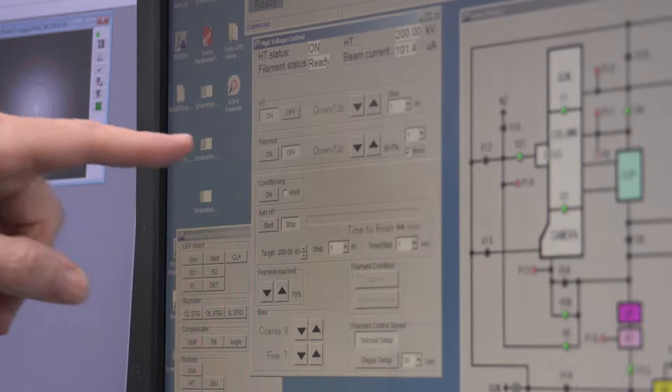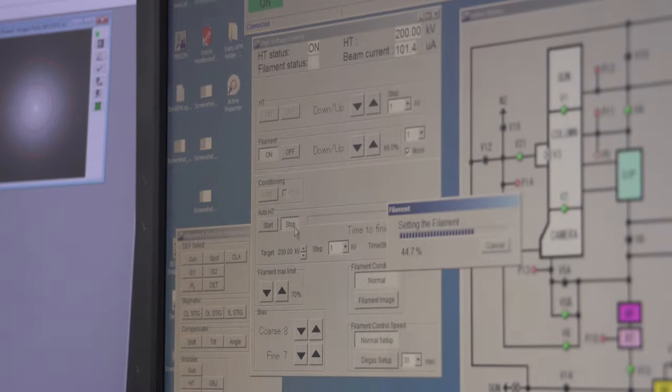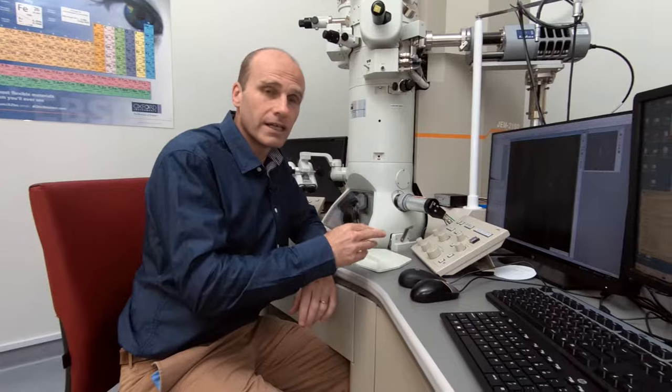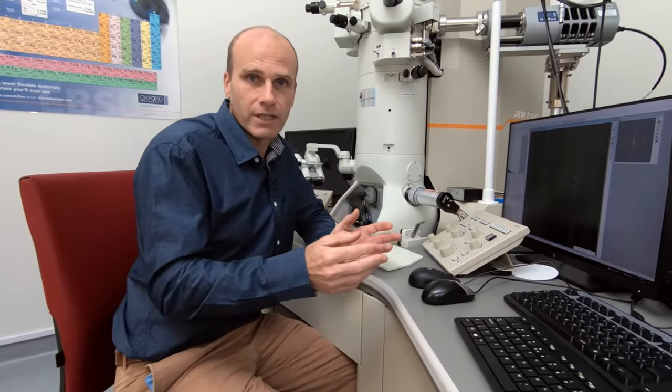Now what we need to do is turn on the filament and get some electrons that we can use. We're heating up the filament, and this is giving the electrons in the filament enough energy so that they can escape from the material. In our case, on this microscope, we're using a single crystal of lanthanum hexaboride. And the electrons, when they escape, we can accelerate them towards our sample and investigate it.